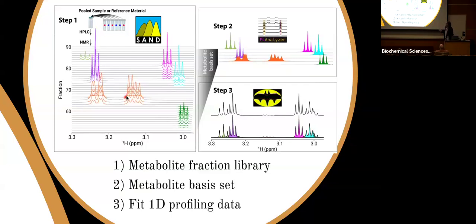If you don't learn anything else about my philosophy right now, it's that I think that separation is better at the start, and I'll show you how we're approaching that. So we separate our mixtures. We just do this once for a study. This whole process right here takes about a week. So if you're doing a big study, it's not that big of an additional bunch of work.